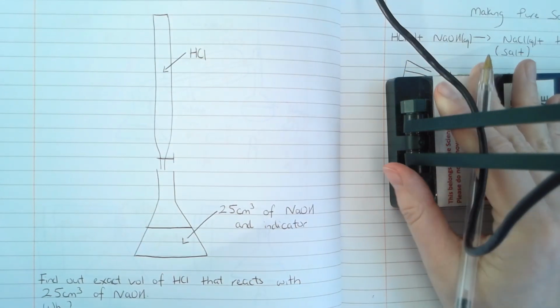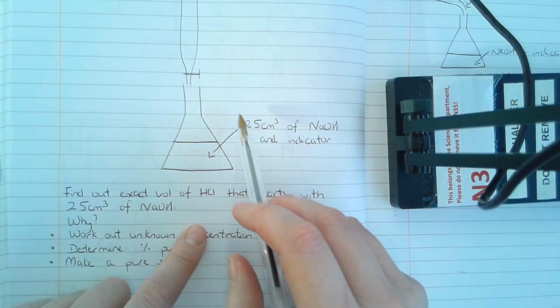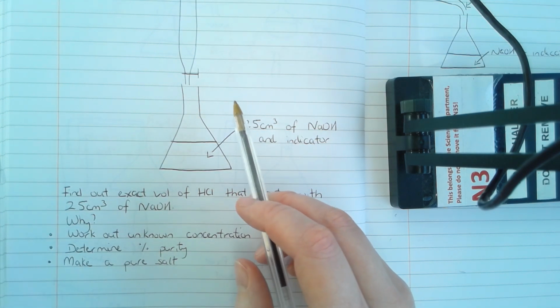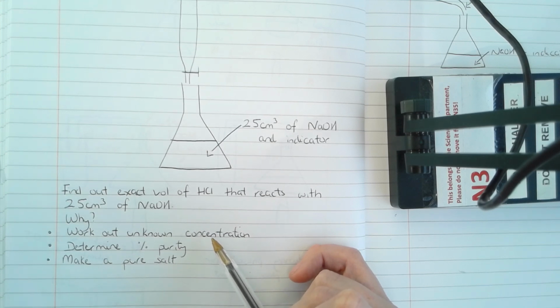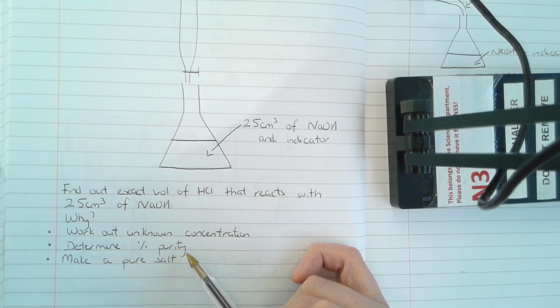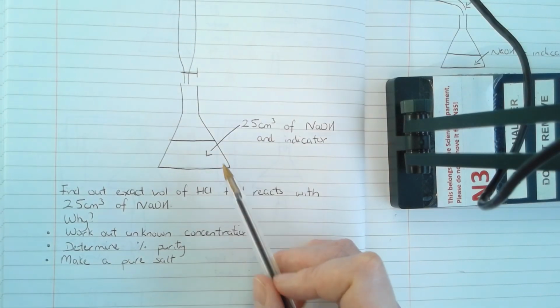And you might ask why. Why is that information even useful? It's actually got a number of applications. If we didn't know the concentration of one of these solutions, we could use a titration to work out what that concentration is. When you find concentration, you can then convert that into mass. So in one of the practicals I just did with my A-level students, we worked out the mass of iron in an iron tablet. You can use it to determine percentage purity. So again, if you had an iron tablet, you can work out how much of the iron tablet is actually iron. The other one we do is we have a brass nail, and we work out how much of the nail is actually brass. So you can use titrations to do this.